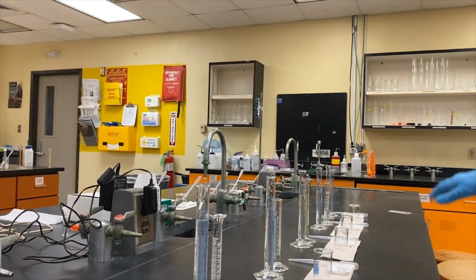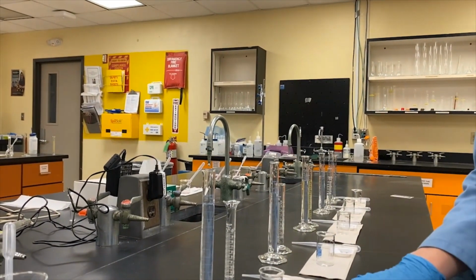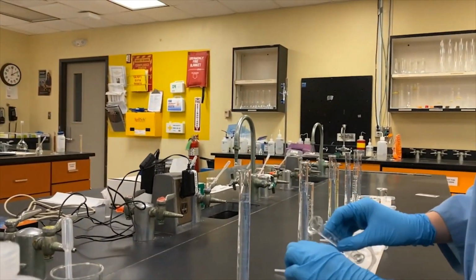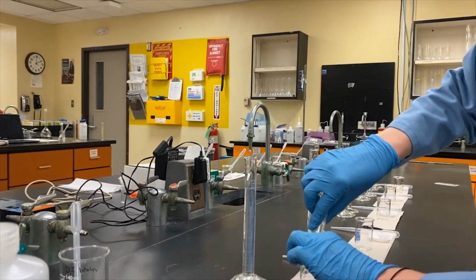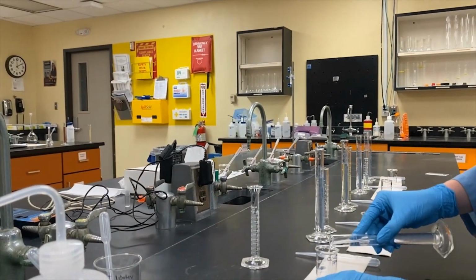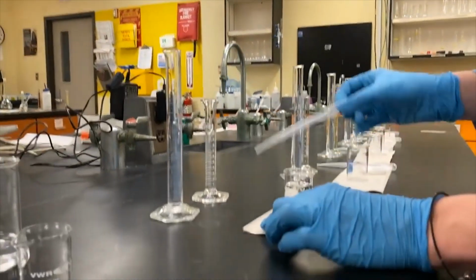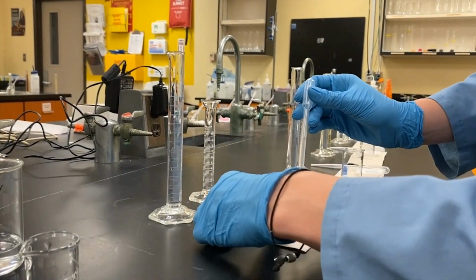We've pre-poured everything else. So the last thing I'm going to do is mix our stock solution with our DI water and add the DPD. So this is going to make our smallest solution here. This is the 0.40 ppm. Going to add our water. So we're making 25 milliliters of each solution, and our last little thing is we're going to mix in the DPD.